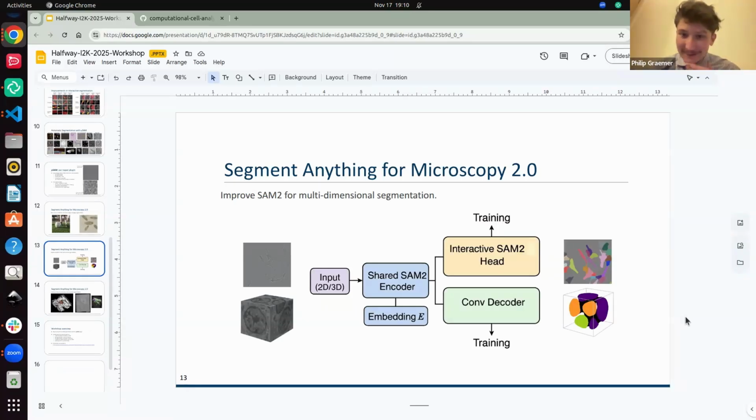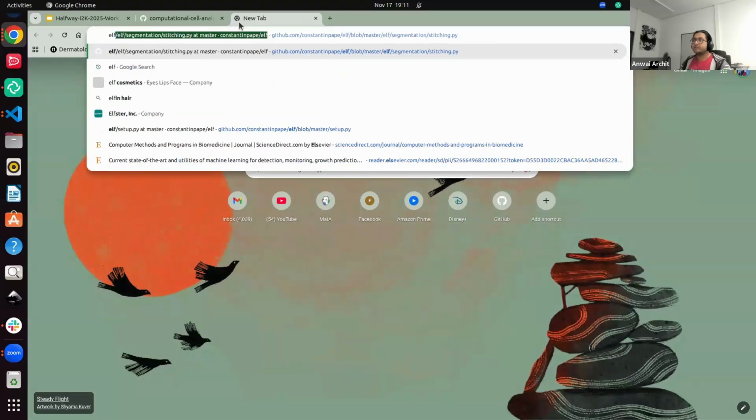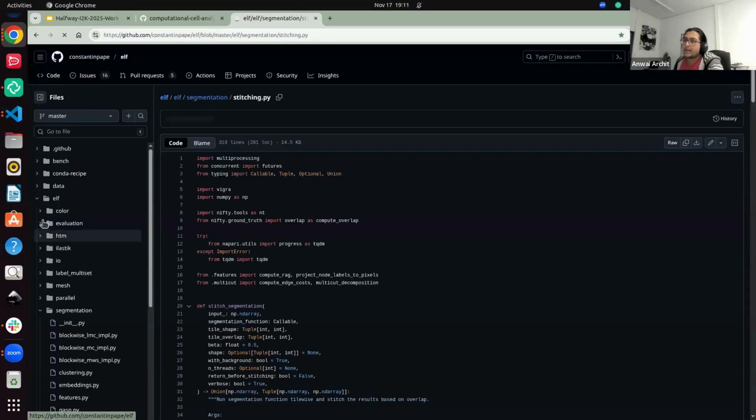Cool. Thank you. And a last question, if I may, what would you suggest to use as validation metrics, or what have you used? Just IOU or? So there is a metric, and I would quickly introduce you to a package which is called ELF. And I will leave a shout out for ELF. It's developed by Constantin, and we maintain this actively in our lab right now.